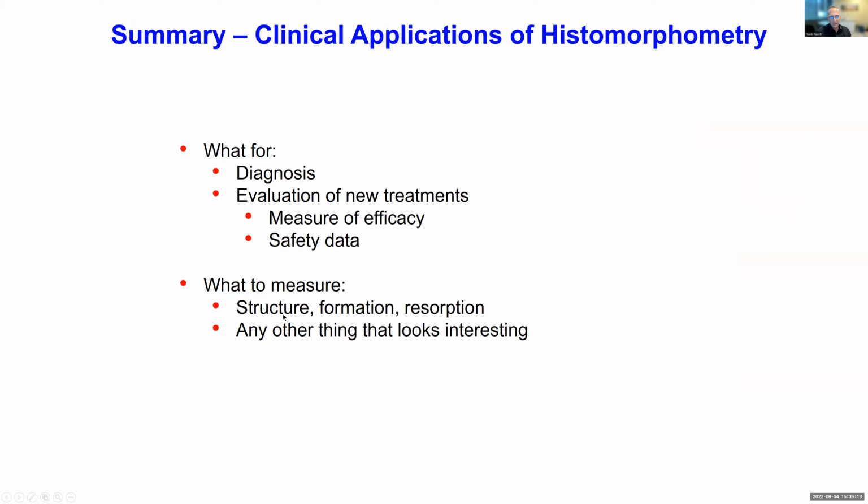You can measure structure, formation, resorption, but also anything else that you find interesting or that's relevant to your question, like we saw in the last example, these individual treatment lines. So whatever is the question, you can quantify that with histomorphometry. And I think that's it.